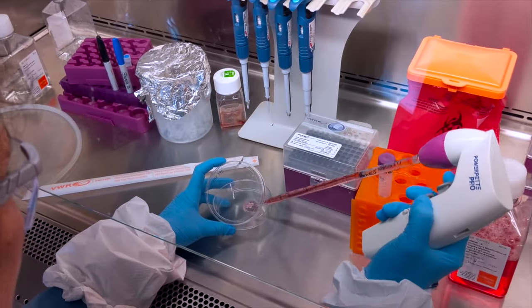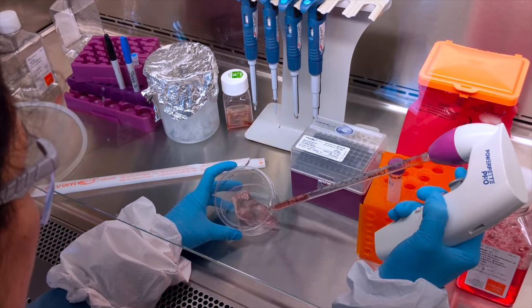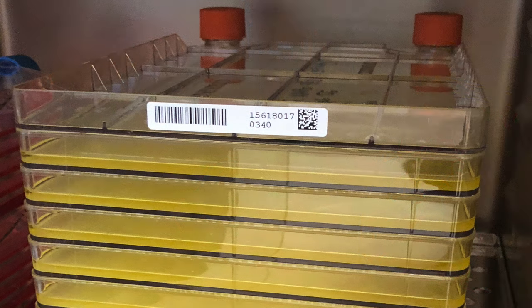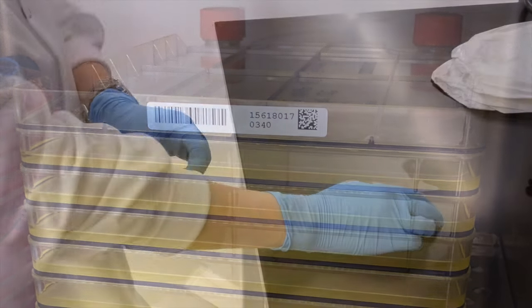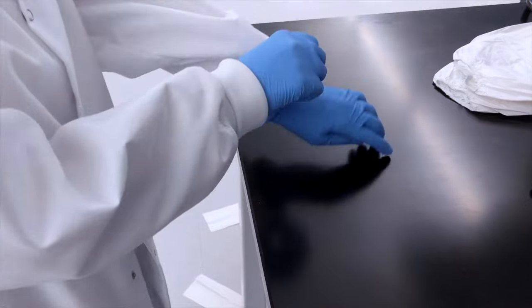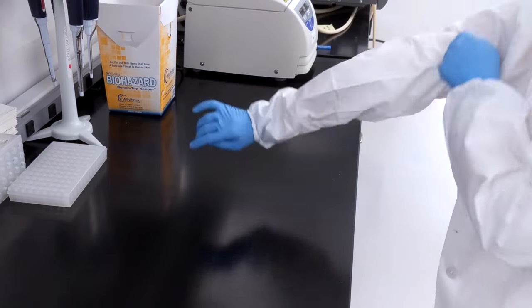As we mentioned during our protocol on getting started with tissue culture, body flora can be a common cause of contamination in reagents. To reduce the risk of contaminating your samples with body flora, ensure that your arms and wrists are covered by a cuffed lab coat or disposable arm cuffs.